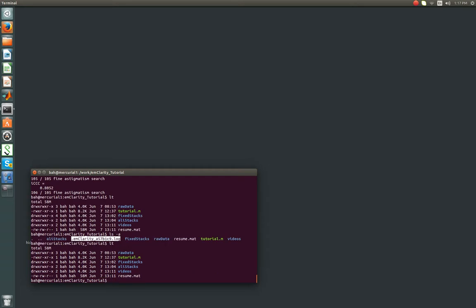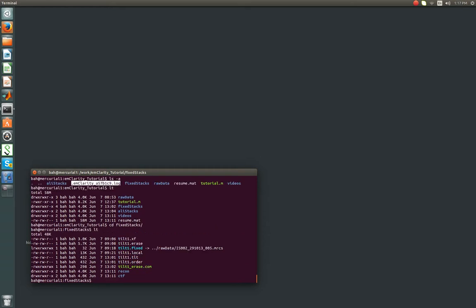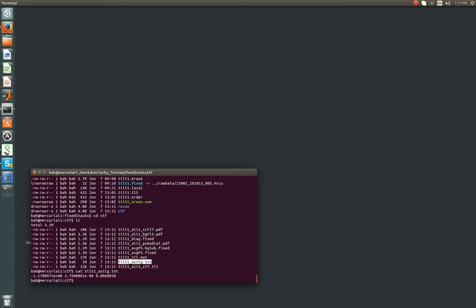So first we're going to look at what just happened here. So under fixed stacks, we run CTF estimate. If it doesn't already exist, a new directory is created called CTF, which we're going to move into. And then a handful of files which are prefixed by our tilt series prefix are put out. So we'll start with the astigmatism dot text. This just contains some files, and you want to check and make sure it's reasonable. So this was an astigmatism of 37 nanometers, which is pretty small. It's not tiny. In the single particle world, it's actually pretty big. But for tomography, it's not too bad. It isn't really until you start getting up into the hundreds of nanometers that it really becomes essential to correct.